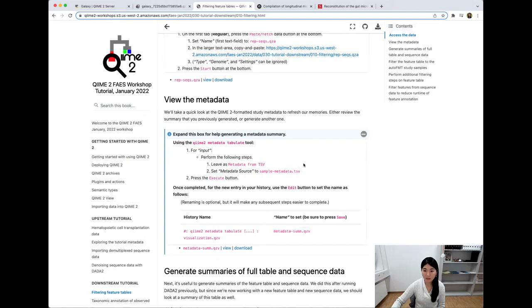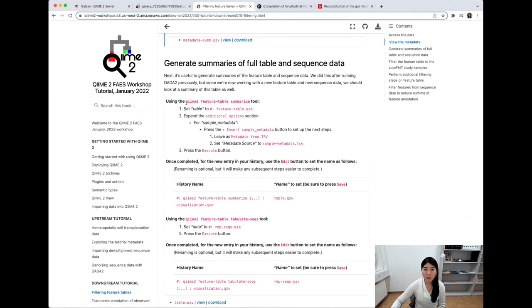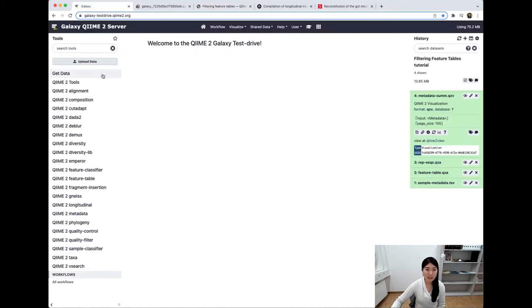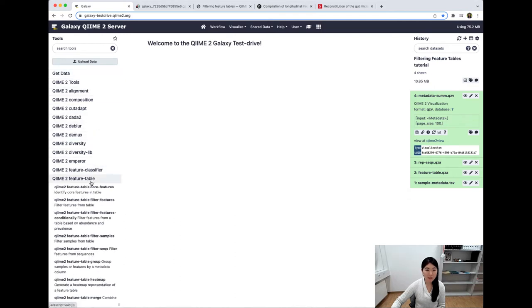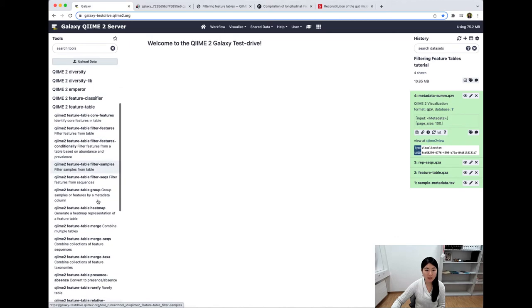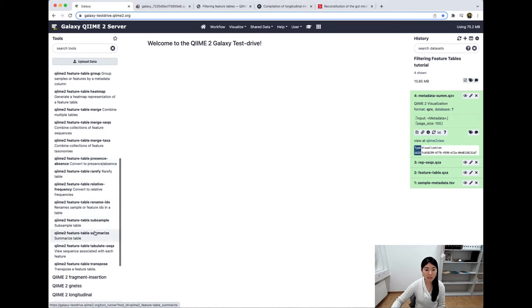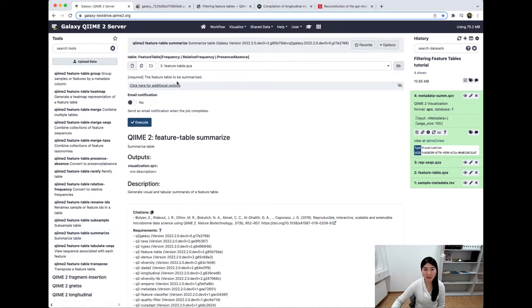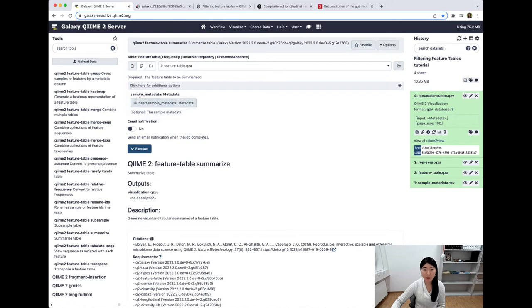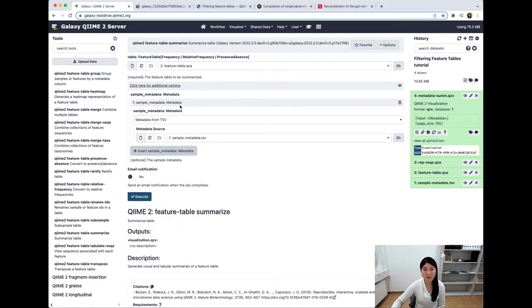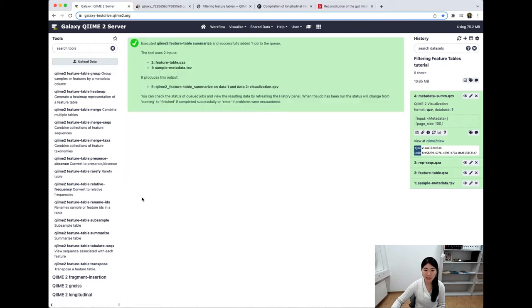Back to the tutorial — we want to use this QIIME 2 feature-table summarize tool. We'll head back to our Galaxy server. Right here on the left-hand side, we have QIIME 2 feature-table — QIIME 2 feature-table summarize. We have to scroll down a little bit. We want to use this feature-table.qza that we just uploaded. Under additional options, we do want to insert the sample metadata because we want to associate it with the feature table. These default options — metadata from TSV and sample-metadata.tsv source — look great, so we're just going to execute that now.